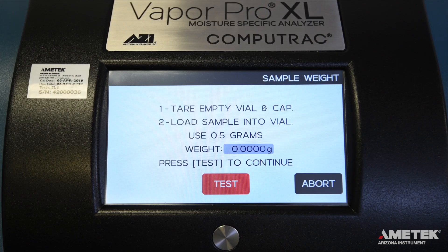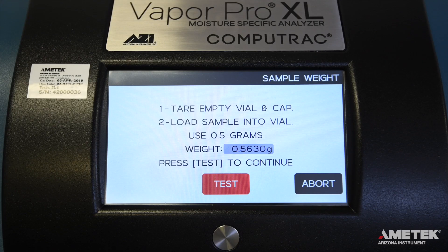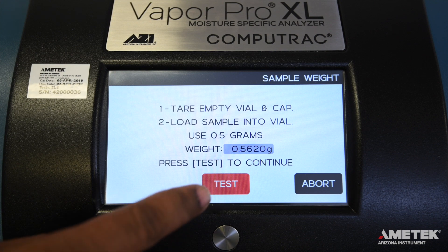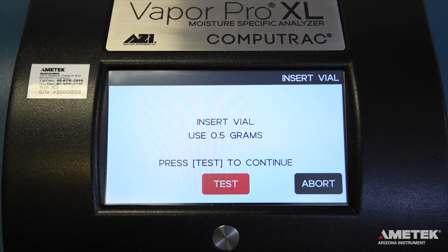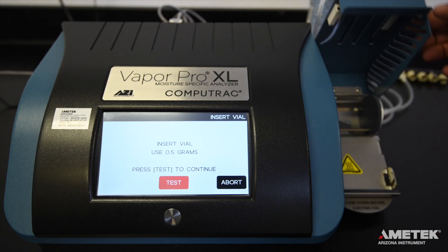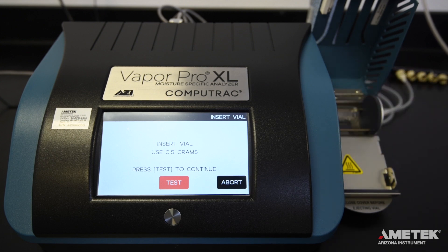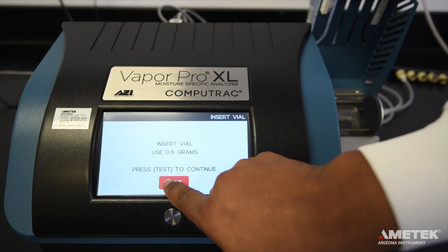Enter the weight into the instrument when prompted. If using the connected accessory balance, the instrument will pull the weight from the attached balance after the test button has been activated. The sample must still be on the balance at this time for the instrument to pull an accurate reading. After you've entered the weight into the VaporPro XL, the instrument will prompt you to place the vial on the transport and close the ramp cover to begin the test.